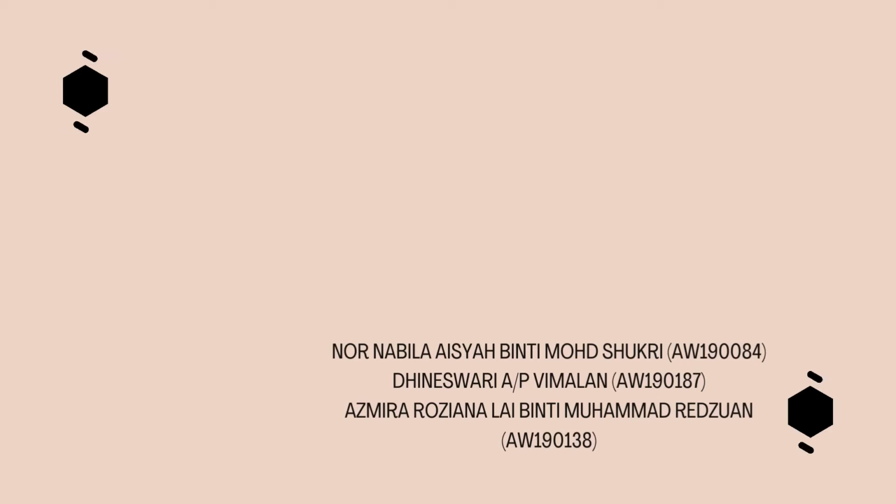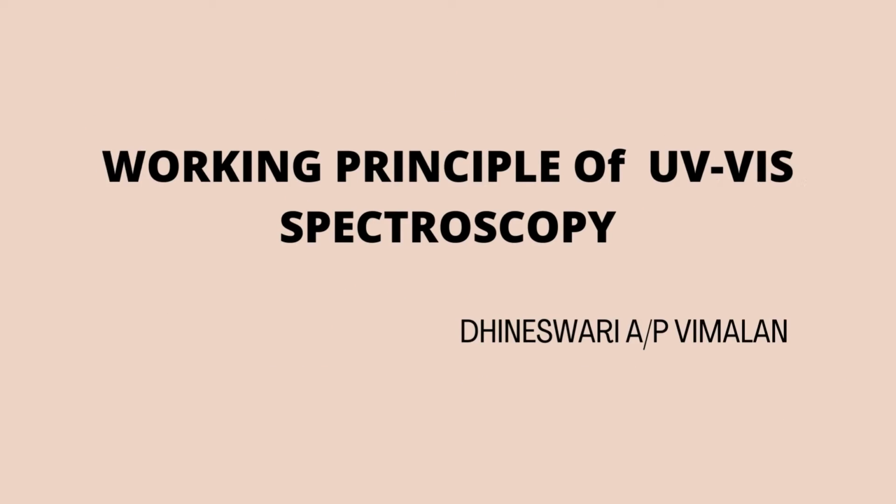Hello guys, we will explain about ultraviolet visible spectroscopy in this video. My name is Dhines and I will explain about the working principle of ultraviolet visible spectroscopy.